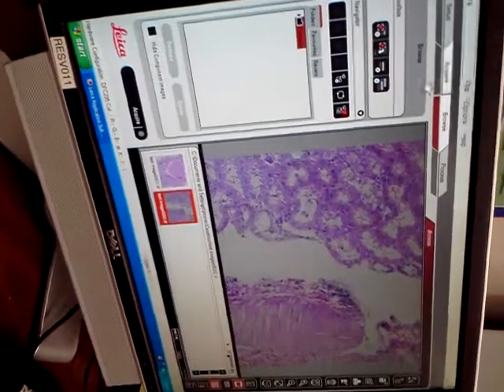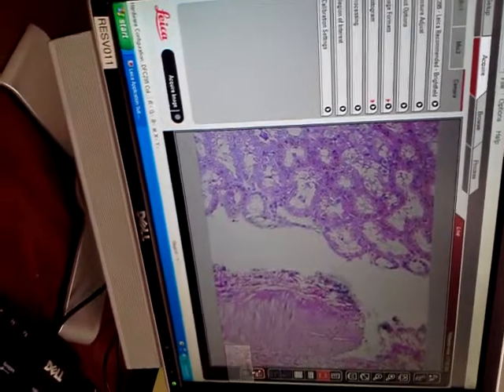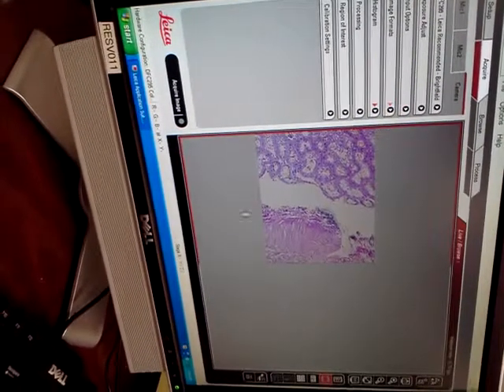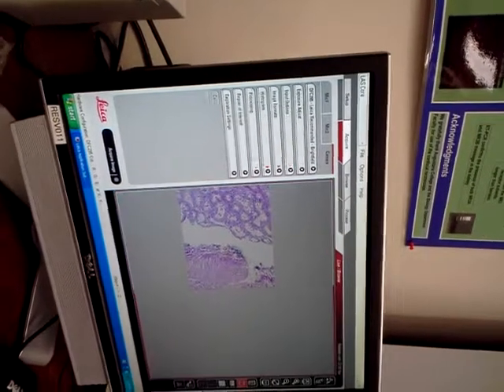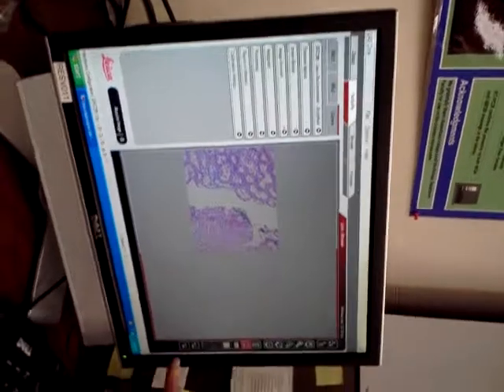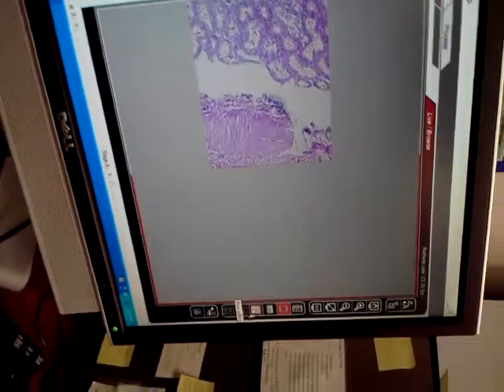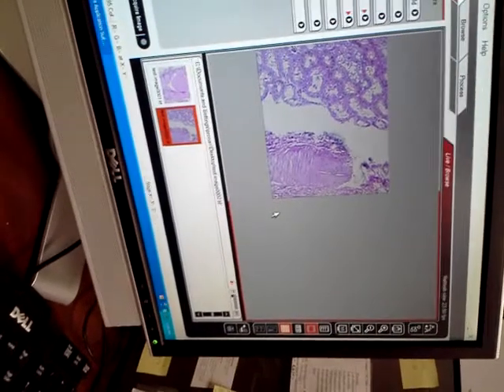I'm going to go back to Acquire now. I can do Dual Viewer. This is my live image right here. Now my right image, I don't have a gallery, but over here, this is going to be with you all the time. So I'm going to activate my gallery down here, making sure I'm on this right side.